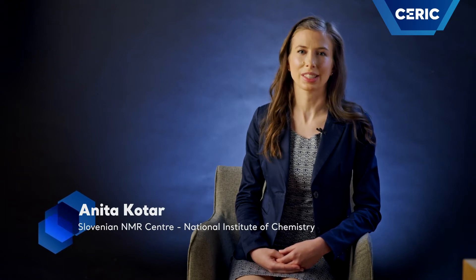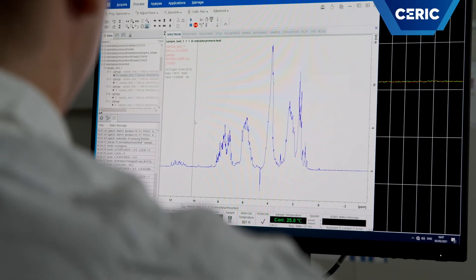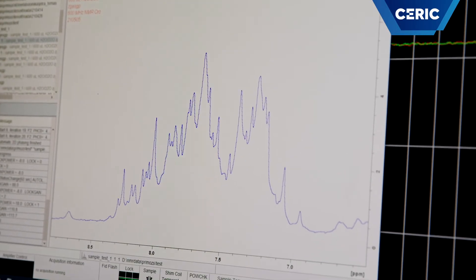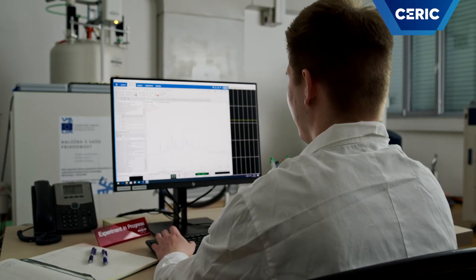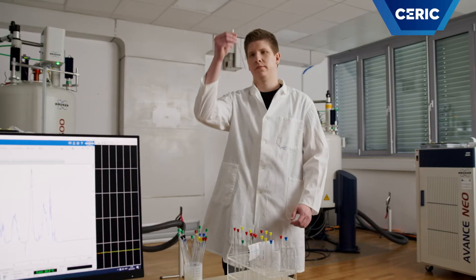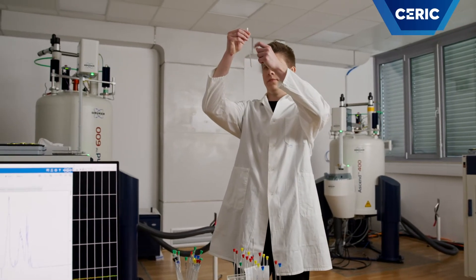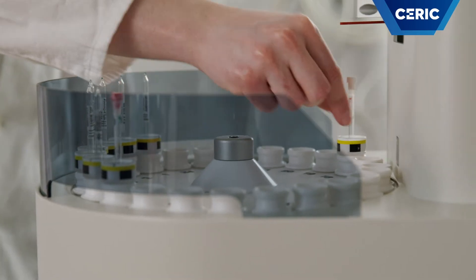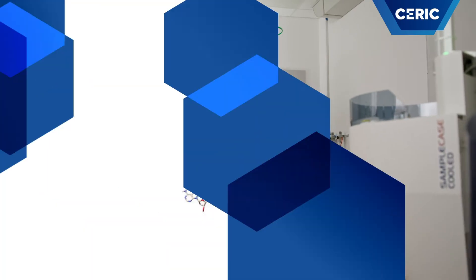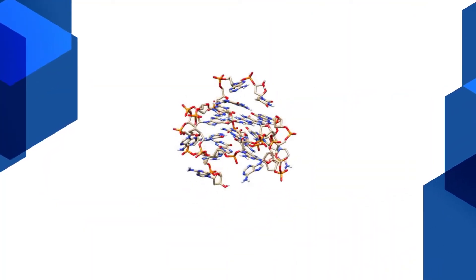NMR is an abbreviation for nuclear magnetic resonance. For the analysis of molecular structures at the atomic level, electron microscopy and X-ray diffraction instruments can also be used. But the advantages of NMR are that sample measurements are non-destructive and there is less sample preparation required. NMR spectroscopy is a versatile tool that provides information not only on the structure but also on dynamics of biological and synthetic molecules at the atomic level.